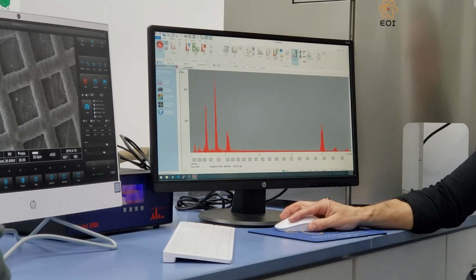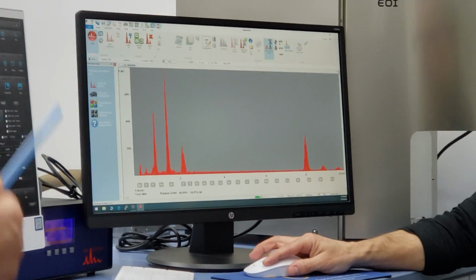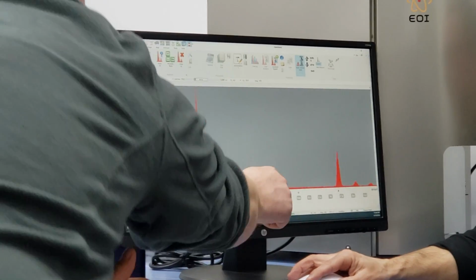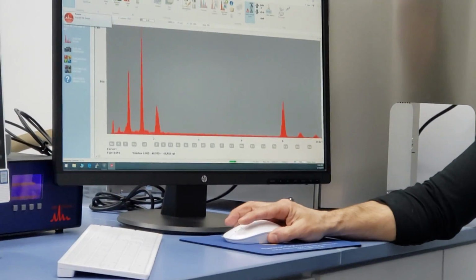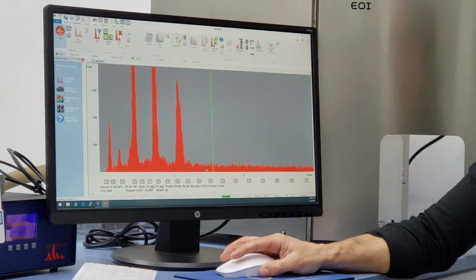We did all this. Who cares? I don't know if we're talking about that anymore. So you're saying that this is all noise, or would it be fair to say that these are trace elements? There's trace elements in this noise.